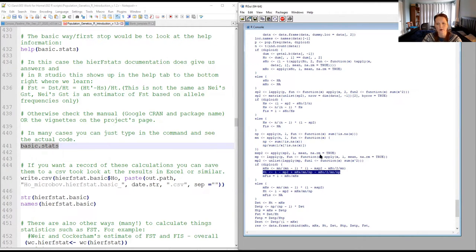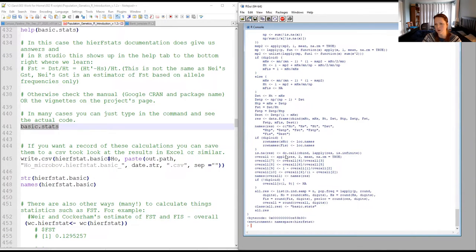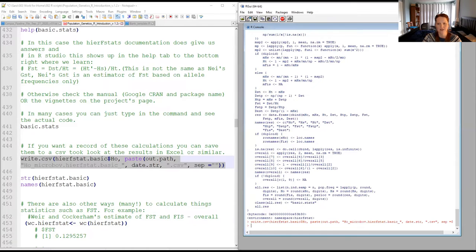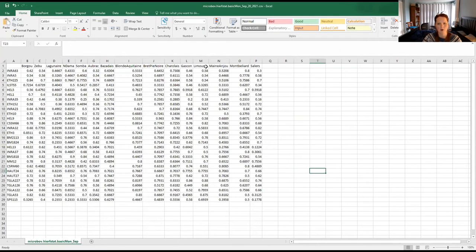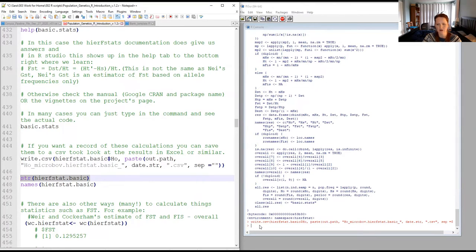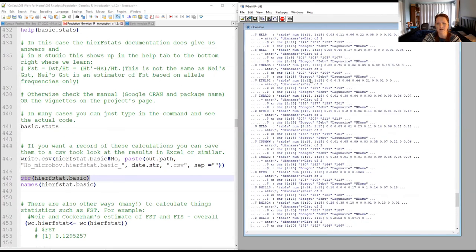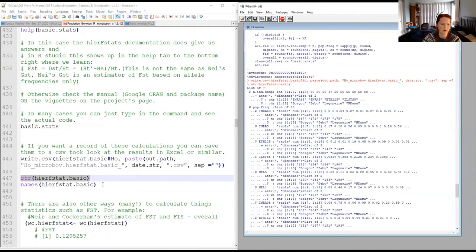A question might come up: how was FST calculated? A reviewer might ask exactly what you did, because there are many different ways of calculating FST. First, type help() — that can be your first stop. You can also get to the manual page from CRAN, which will have the manual and any vignettes. If you can't find the information there, you can actually just type in the function name without parentheses, which in most cases will display the actual code being run on your data. For example, looking at the code tells us it's calculating FST as DST over HT.